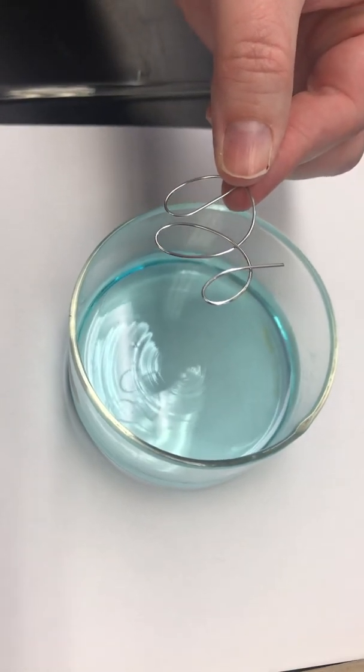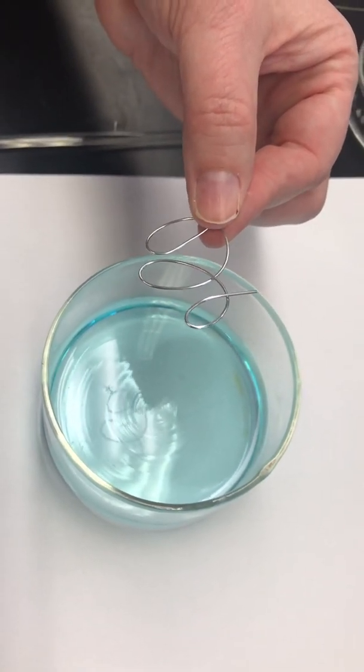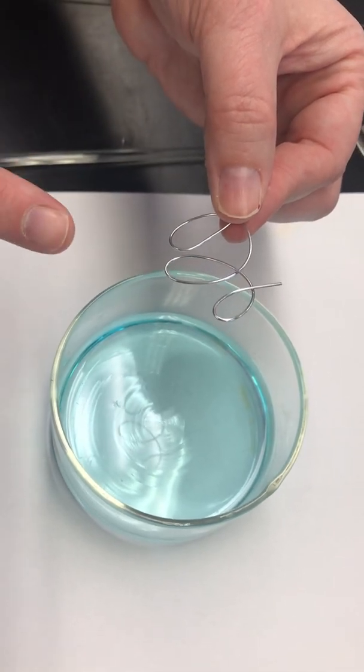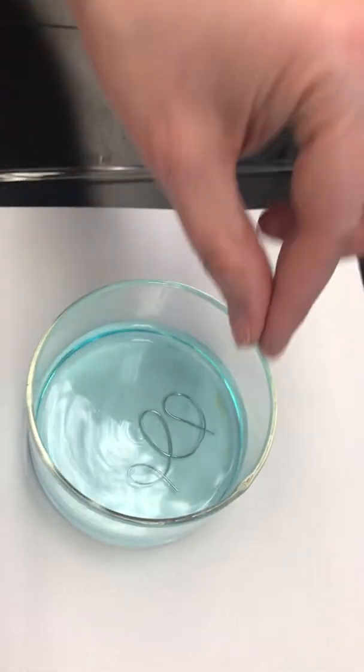Okay, so the last step of our lab, we are going to take our piece of aluminum wire and we want to record our observations for the aluminum wire. And we're going to add it to our clear blue solution from the previous step. All right. Now, two things are going to happen here. Let me go ahead and put this wire in.